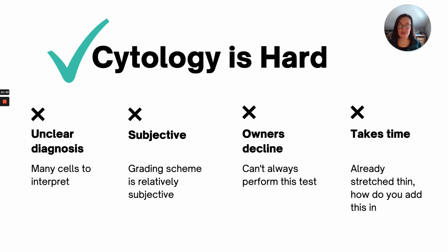Owners decline this all the time because they don't see the true value, or they literally can't afford it. They're here because they just need to treat their dog and they don't have the extra $30 to spend on cytology. So that's definitely a challenge. And it takes time out of our day. We have to leave the exam room. We have to go read our slide. We have to collect the slides, stain the slides, all that it entails. So when you're running 15-minute appointments, it definitely is a challenge to add in cytology, and I absolutely get that.